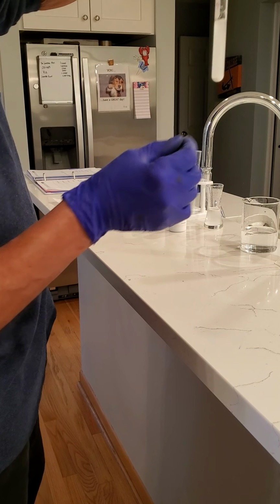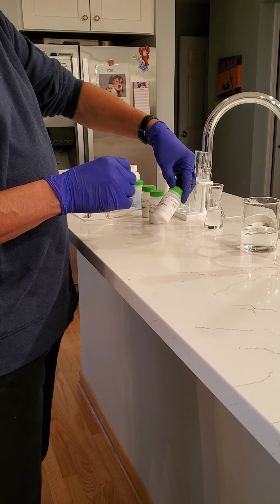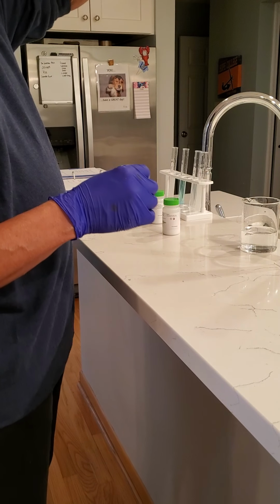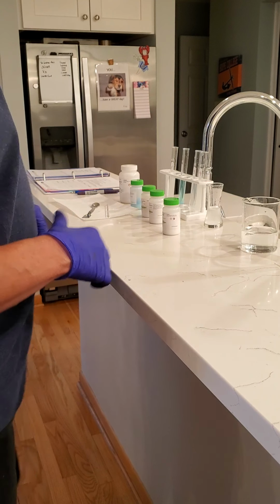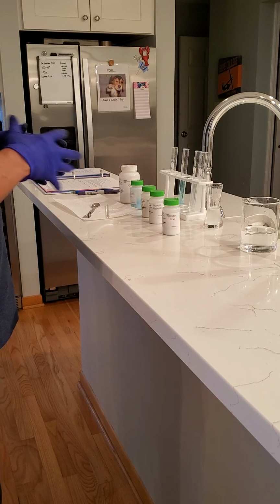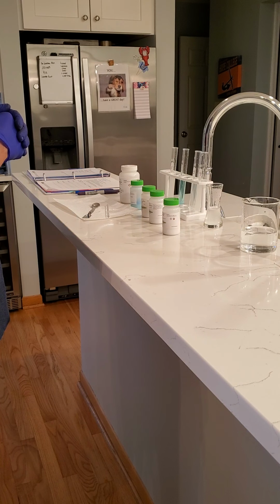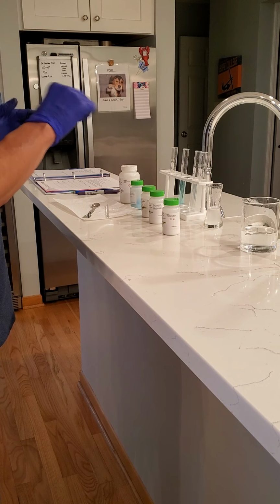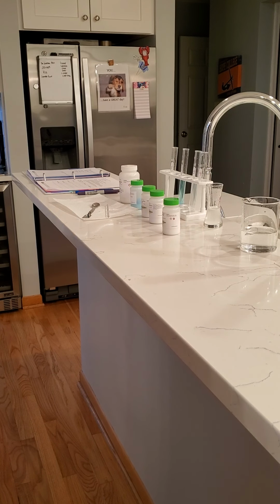Cloudy at the top with solid at the bottom. And then our sodium tetraborate. So give it at least 10 minutes for the solubility to occur within the test tubes, shaking them occasionally, and then make your final observations at the end as to how soluble each of these salts are compared to each other. Okay?